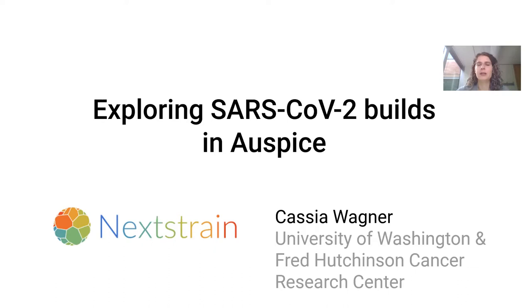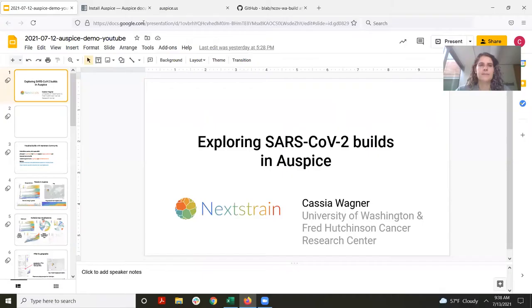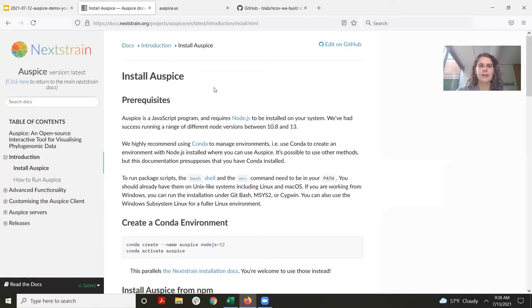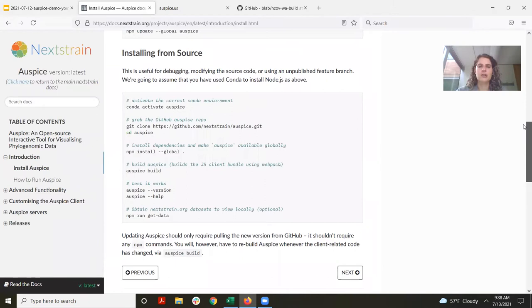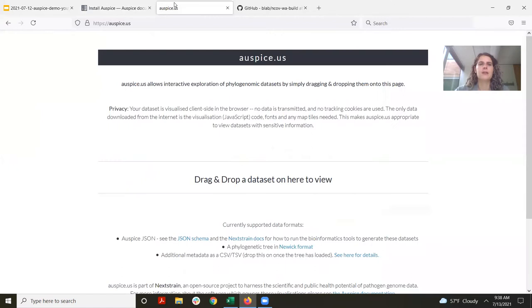When you use Nextstrain to build a phylogenetic tree, the main output file is going to be a JSON tree file. You can take this JSON file and look at it in Auspice using a couple of different methods. The first method would be to actually install the Auspice software locally on your computer. There are docs with instructions on how to do so and how to update it. If you don't want to install something, you can also just drag and drop that tree file onto Auspice.